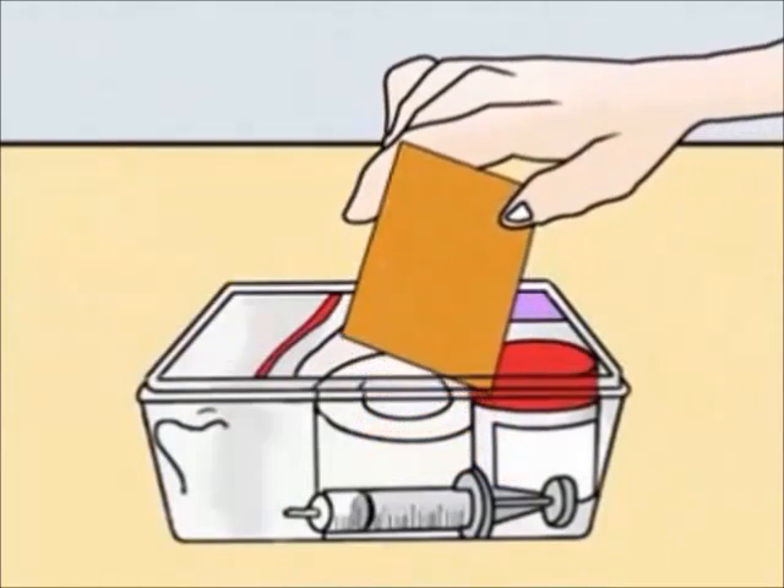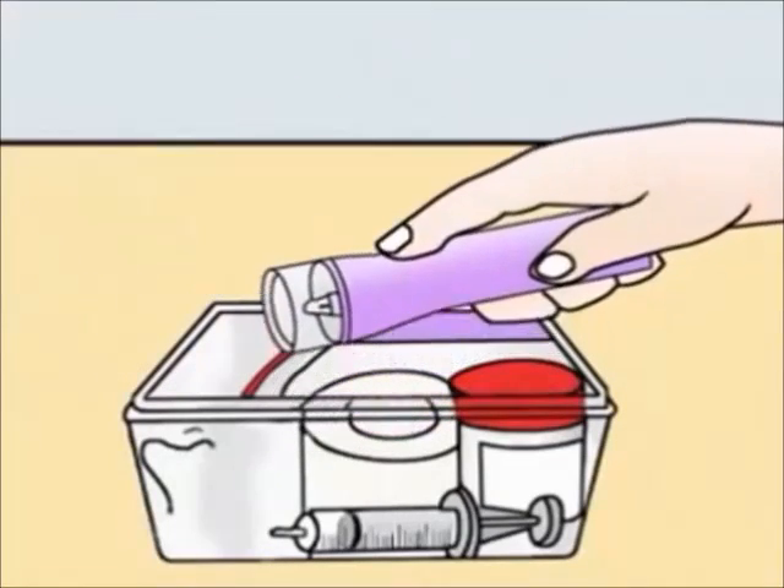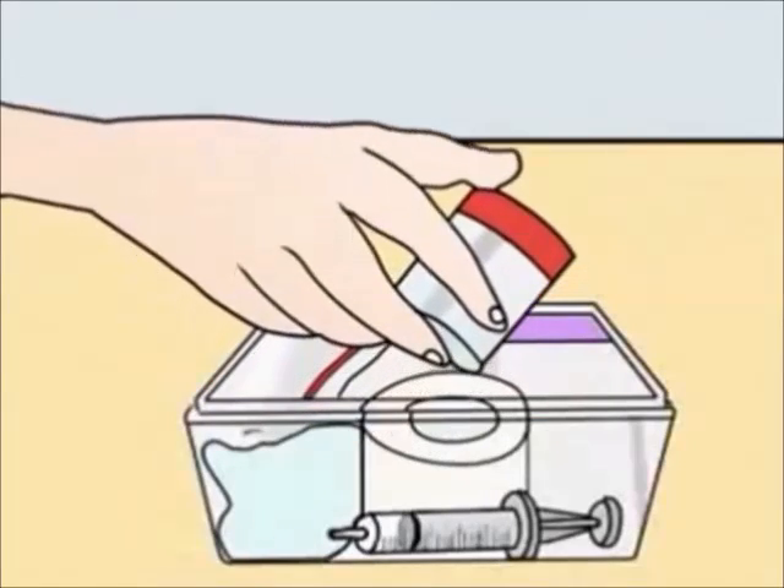The kit must include two stiff pieces of cardboard, two plastic bags, a surgical tape, a torch, and a container half filled with water.